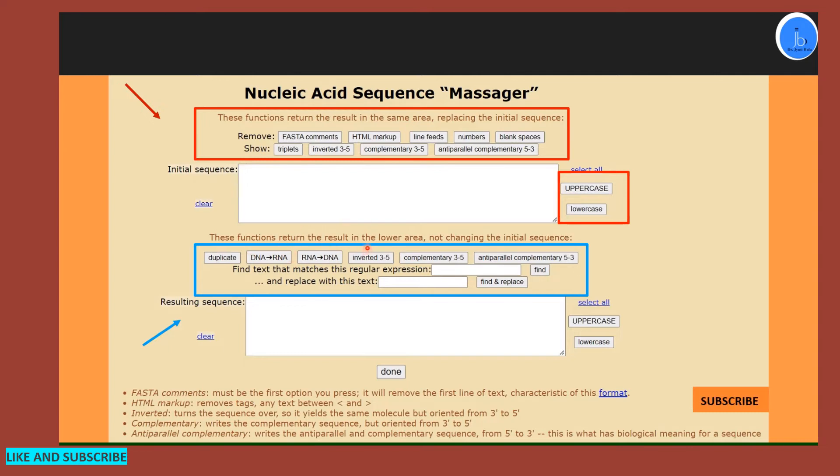Sense and antisense conversion and complementary strand conversion, then these tasks you can perform here. You have to provide the sequence here and the result you will get here. Similarly, for your oligonucleotide and nucleic acids, if you want to convert them like uppercase to lowercase, those tasks also can be done.